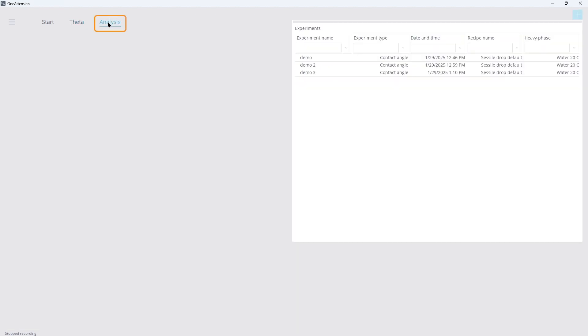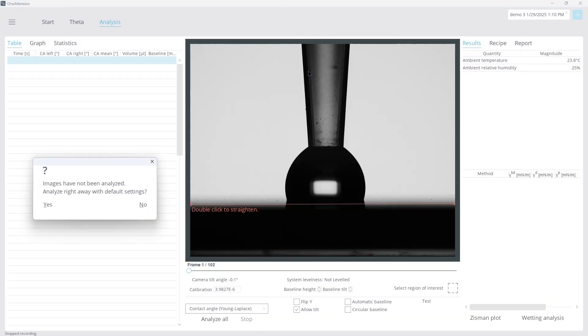Once the instrument has finished recording, switch to the Analysis Navigation tab to review your results. The software automatically adds the most recent measurement at the bottom of the window. Double-click on the measurement and click Yes on the pop-up window.